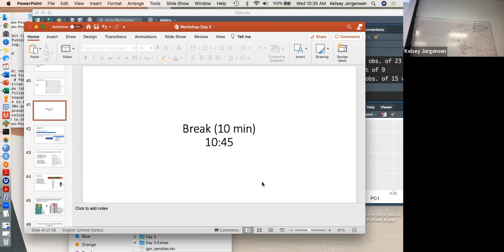So why don't you rerun that first command too? Just copy paste that. Change the 3, 5, 8 to 3.